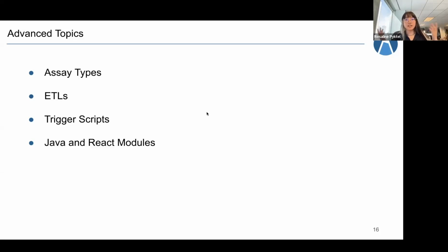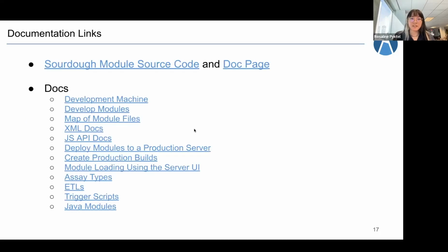So please reach out to your account manager if you want to see a tech talk on any of these topics, or if you're interested in a wholly different topic too. And that just about wraps our presentation for today. Here's the promised doc slide covering our topics for today. You'll be sent the contents of this via email later, but this is just to show the additional topics and the deeper walkthroughs that are available.